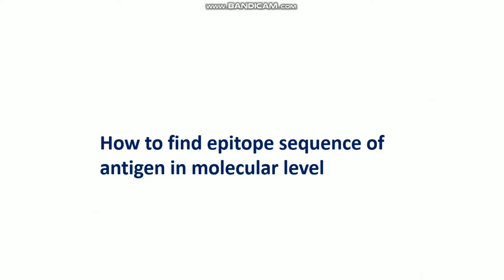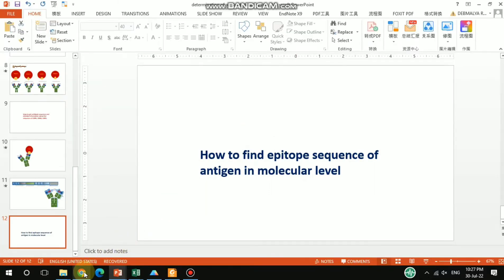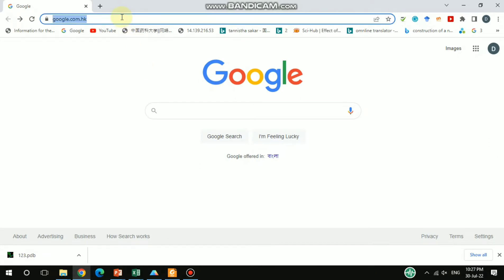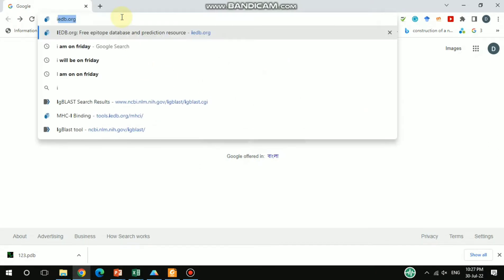This video covers how to find the epitope sequence of any kind of antigen at the molecular level. This video might be a little longer, so if you watch till the end you can learn how to find epitope sequences in detail at the molecular level. Let's begin — for that you have to search one database: IEDB dot org.